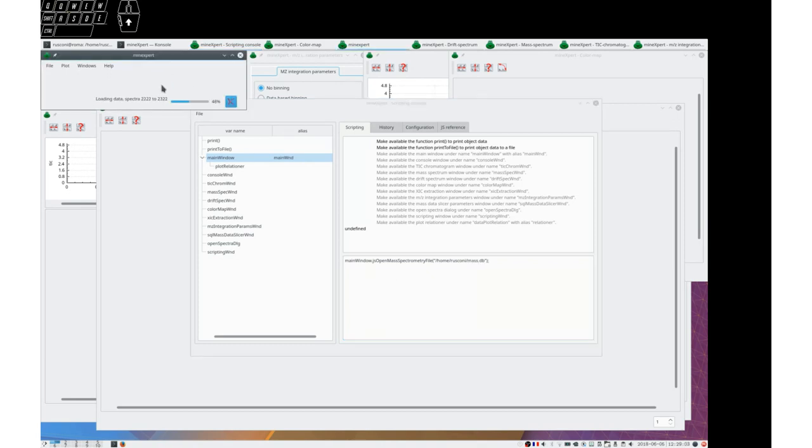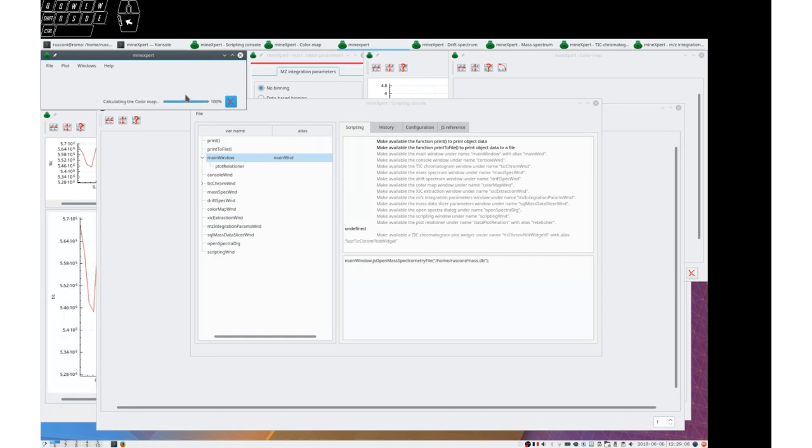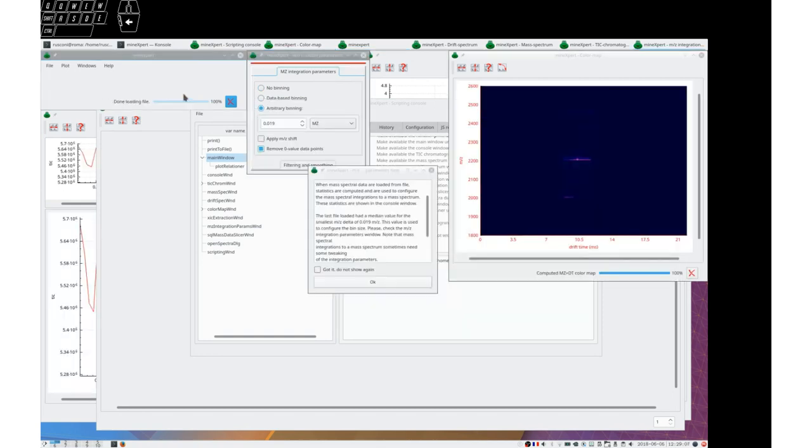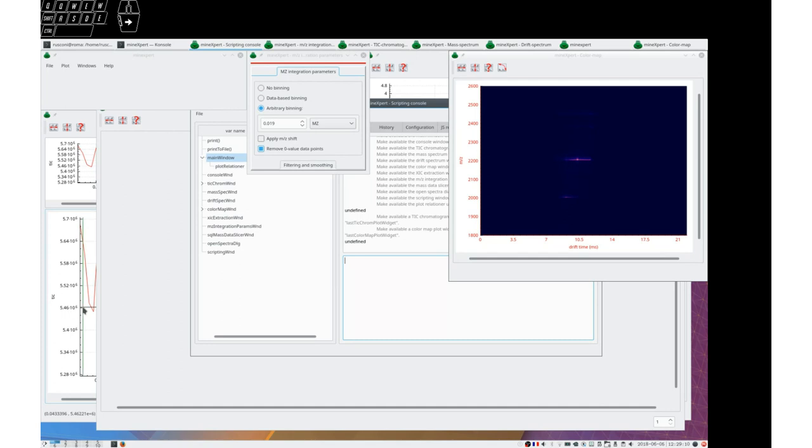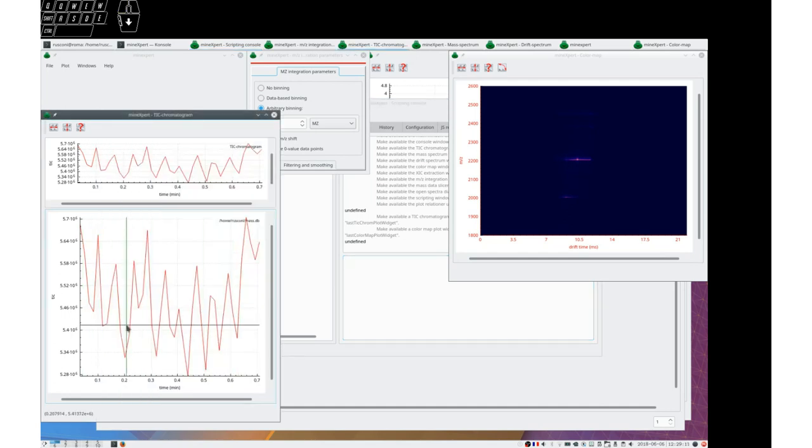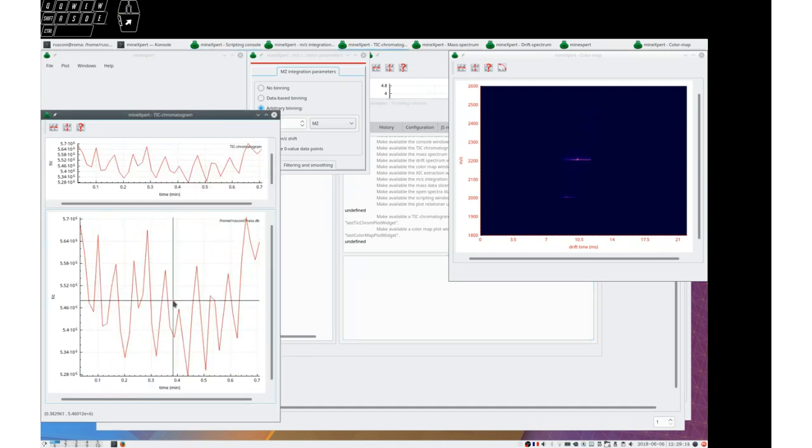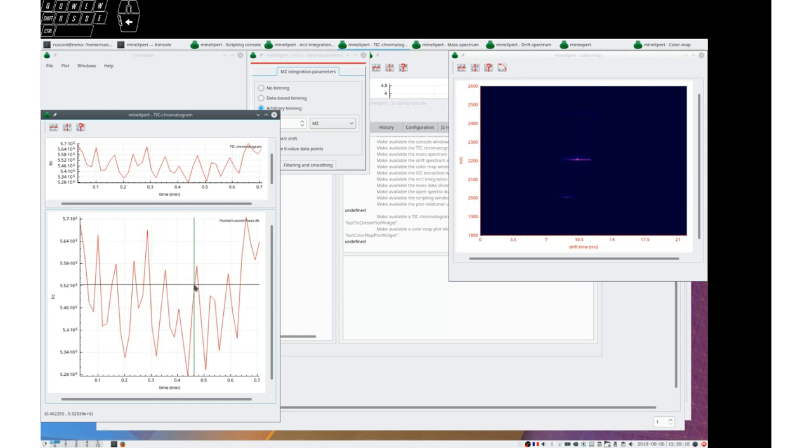You see that the program launches the loader and we have the new tick chromatogram that has been computed and displayed in this widget.